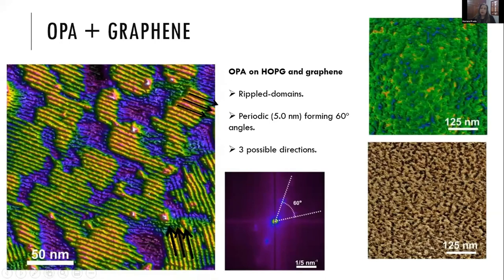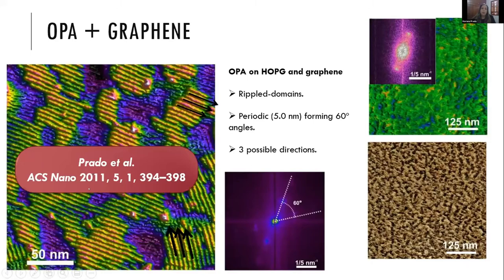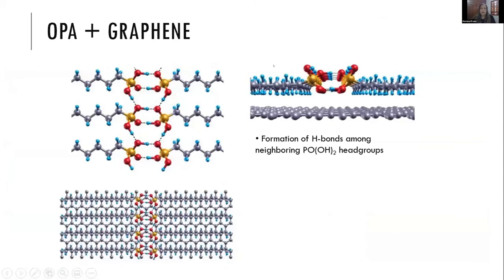For single layer graphene, we have here a topography image and a phase contrast image. The sample was mechanically exfoliated on top of silicon oxide. The flake is on top of a corrugated substrate with the ups and downs of the oxide layer, and the ripple domains of the OPA are here as well. We can see them clearly on the phase image, and the fast Fourier transform shows the periodicity. Here we have one domain oriented in a single direction.